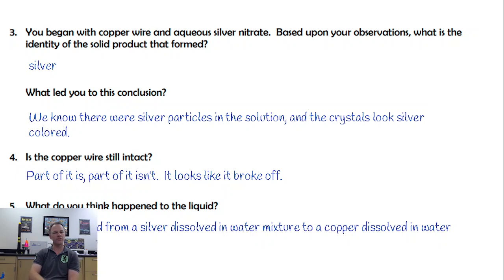So we knew there was silver in there, and the crystals look kind of silvery. So it just makes sense. Is the copper wire still intact? Well, yours probably was intact, or it looked like it was intact at the end of the 15 minutes. People who left theirs overnight found that the copper wire broke off.